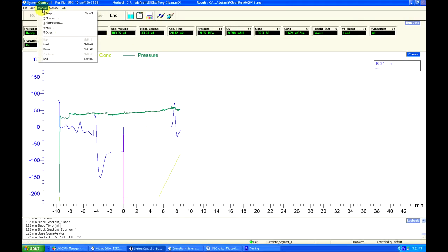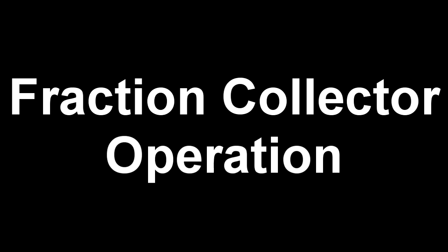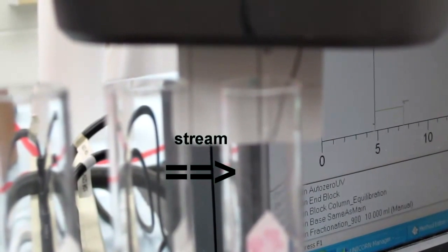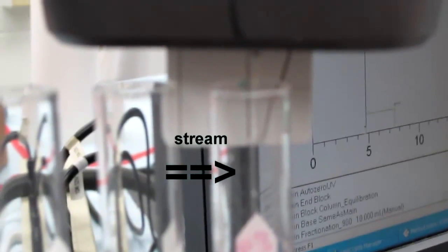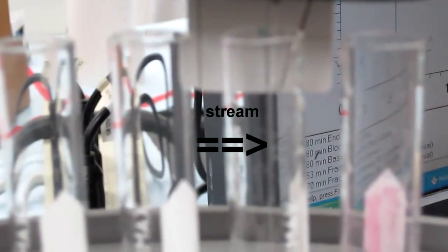We click on Manual, then Frac to pop up the Fraction Nation window. Choose Fraction Nation 900. Type into the message box the amount of milliliters to collect before the fraction collector changes tubes. This is how the fraction collector operates. After inputting a number into the message box and pressing Enter or Execute, the fraction collector will attempt to collect that volume of samples. Hitting Enter again while there is a number in the message box will signal the fraction collector to switch to the next test tube.